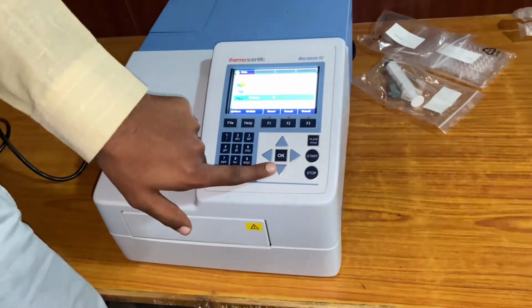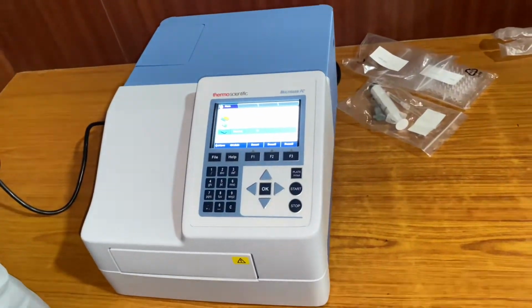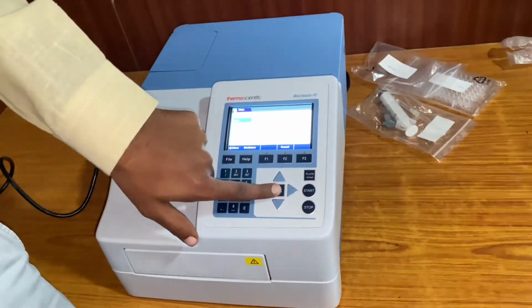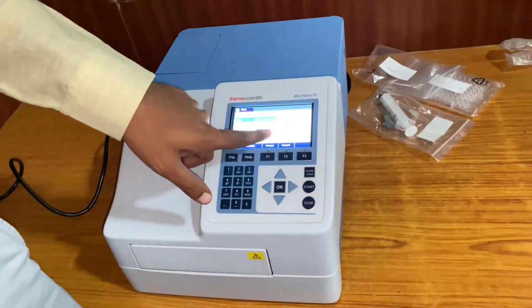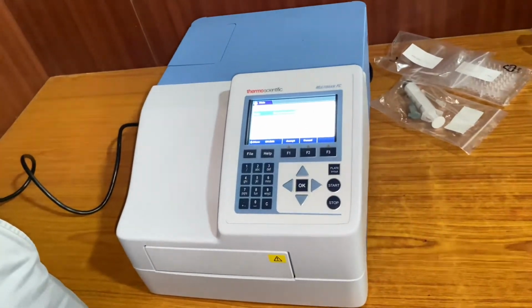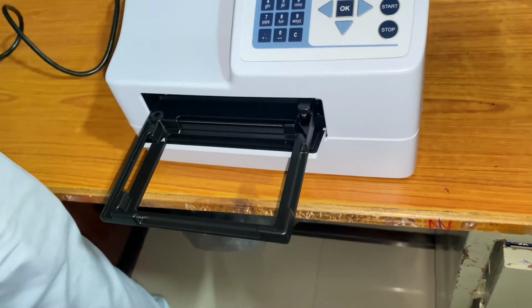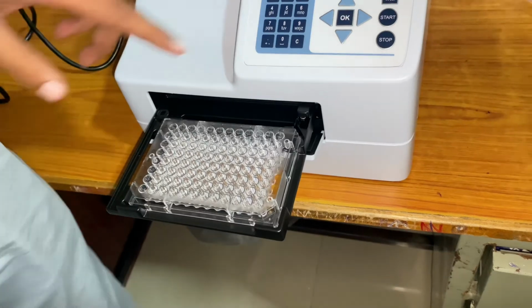In protocol, after you load sample and reagent, there may be a shaking option, measurement or in the background. Maybe I will just take before. We have to define the time, how much time, 5 seconds or 1 minute. This will be defined based on the kit you are using, so based on the protocol. The plate always should be in this direction. Here you see plate A1.